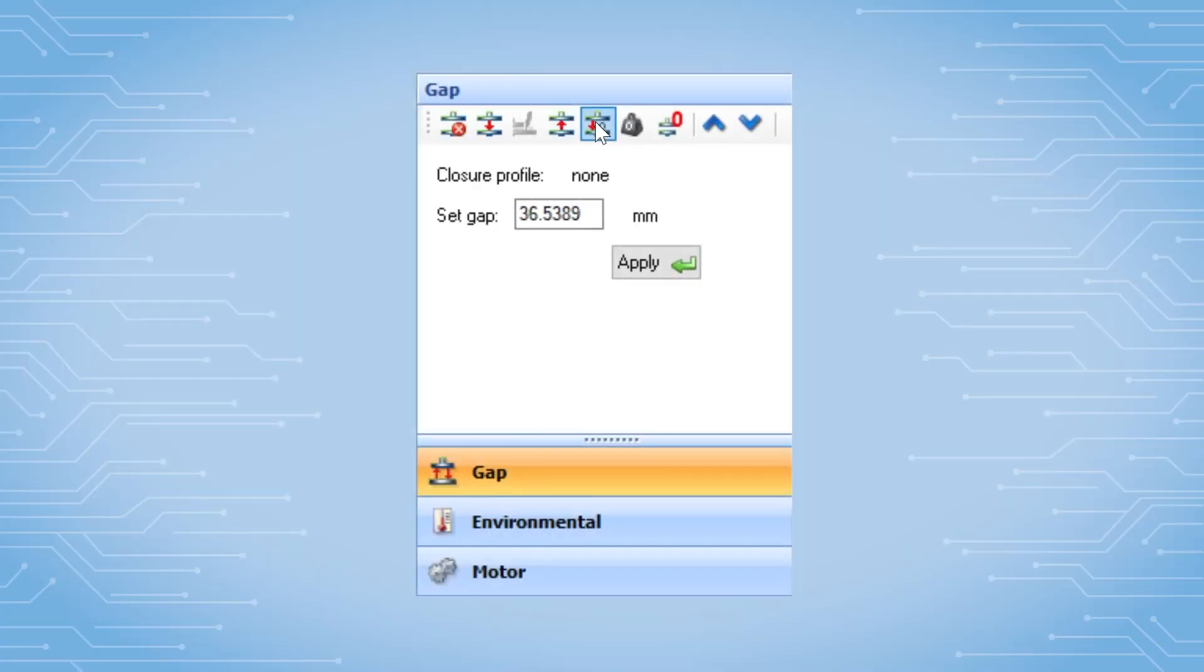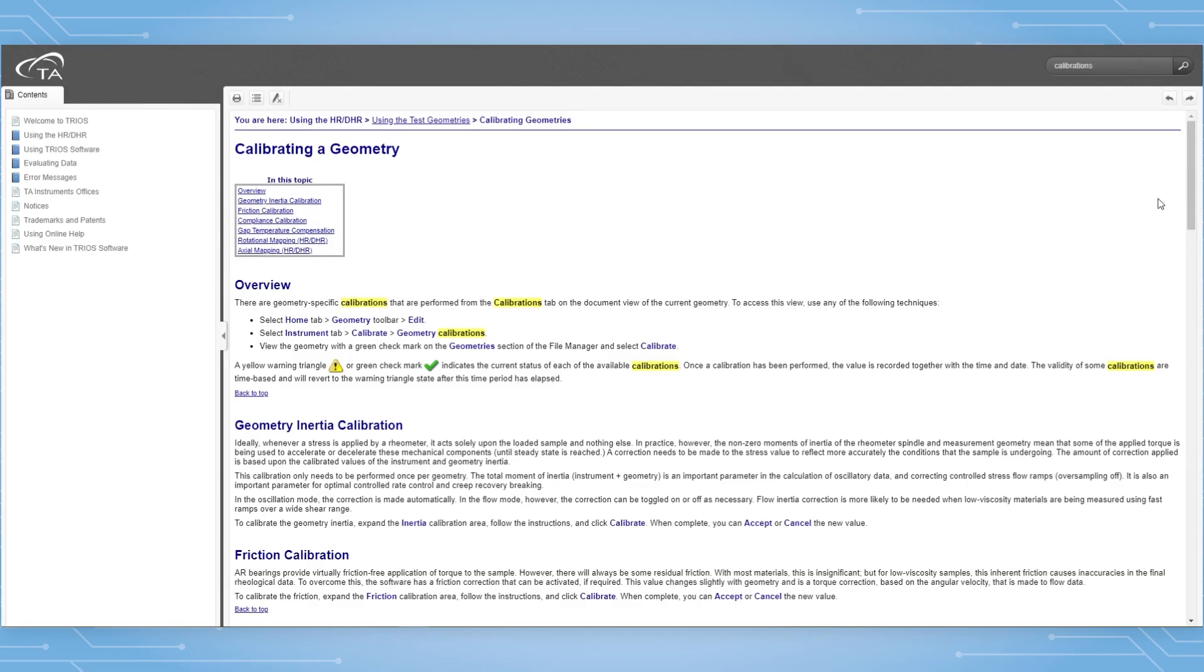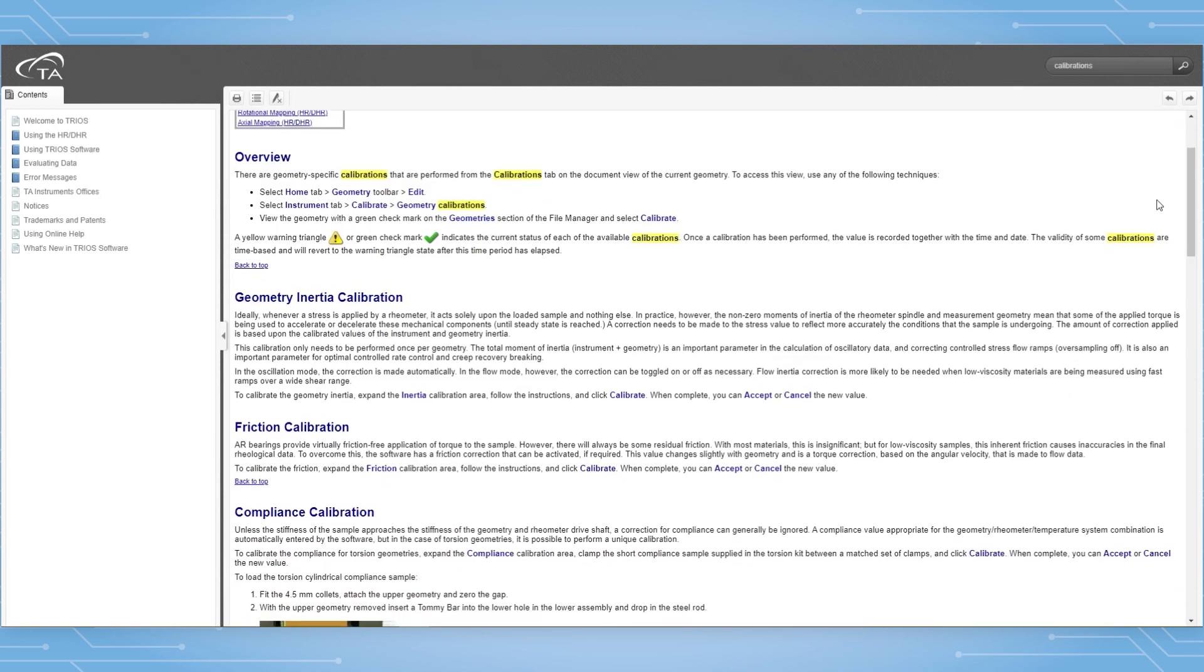Finally, zero the gap. Additional information is available in the help.